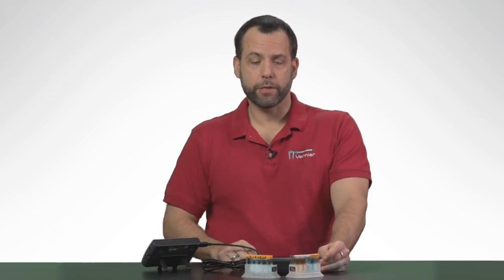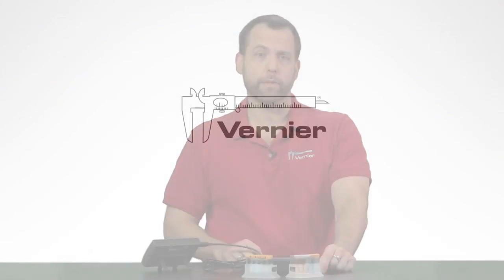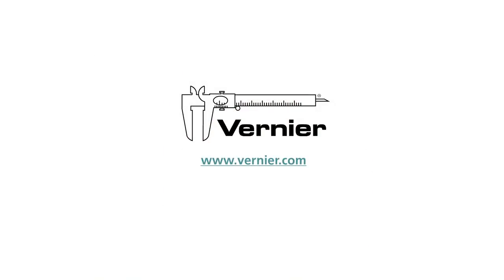I hope you enjoyed this little introduction to our spectrometer, the Spectroviz Plus, which is one of my favorite devices here at Vernier. If you have more questions about spectroscopy or about other sensors, just visit our website at www.vernier.com.